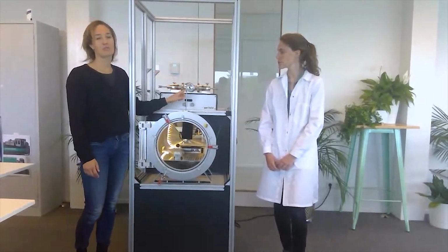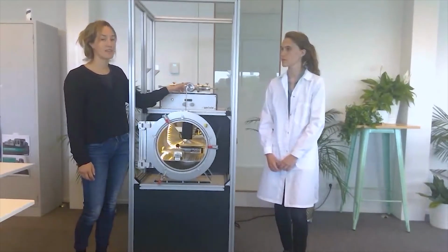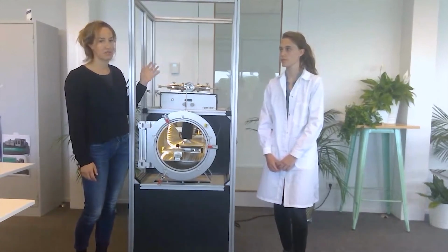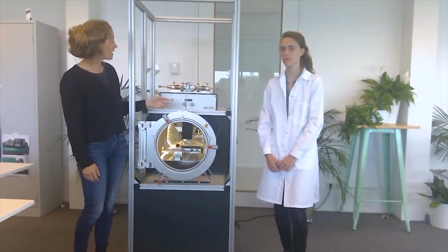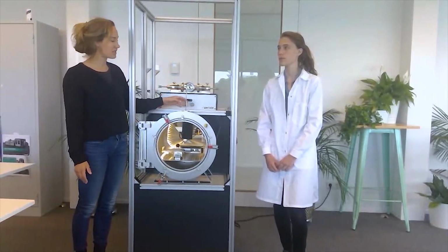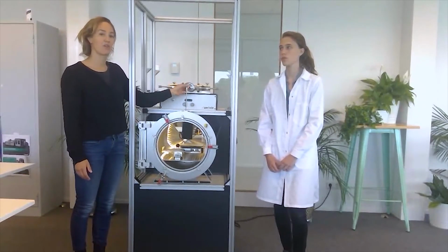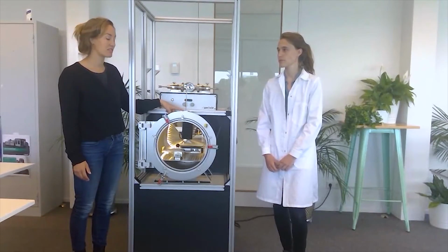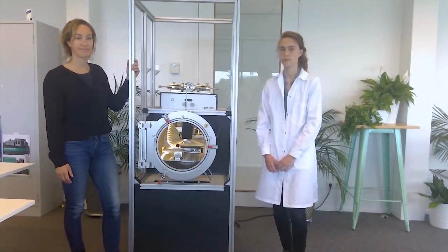And the tubes we clean by flowing a high flow rate through the tubes, and we do that for 15 minutes, sometimes 20. And once every half year we might clean the whole tubes also. That's also easy, just disconnect the tubes on the side.